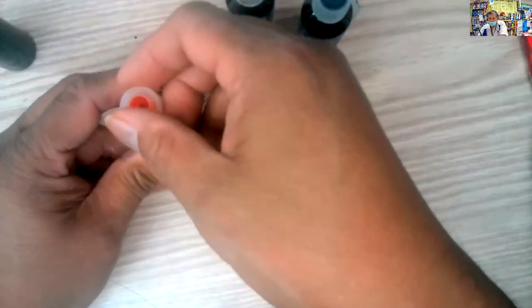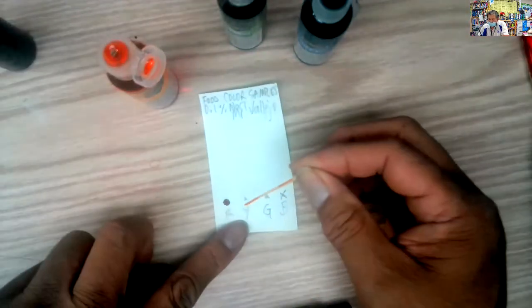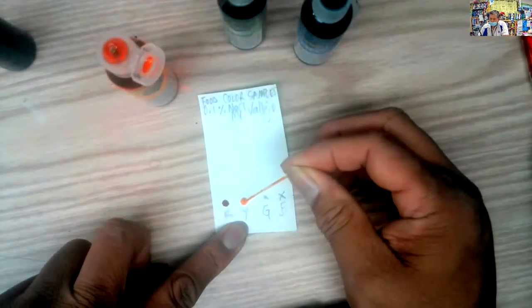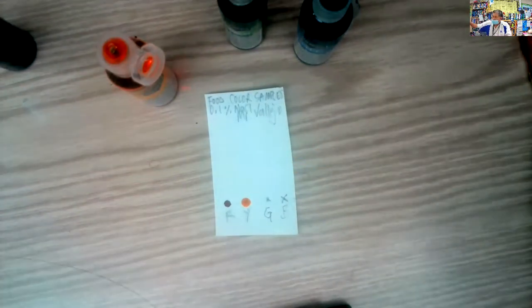Now I'm going to do the same thing with all the different colors. I'm going to flip this away from me because I know it squirts. So there's the yellow. I take that, put it in there, get some yellow, touch it to the paper, and it'll spread out like that. Since I did two on the red, I'm going to try to do two on all of them. So there's yellow. Then I've got to try the green and the blue, so I'm opening both.